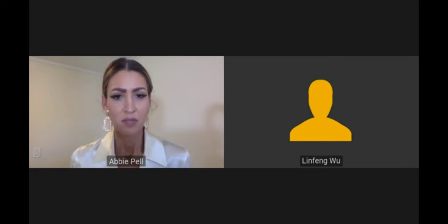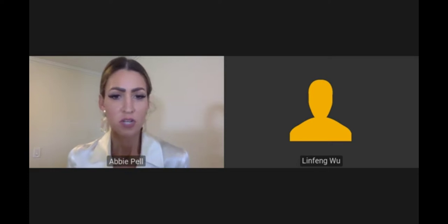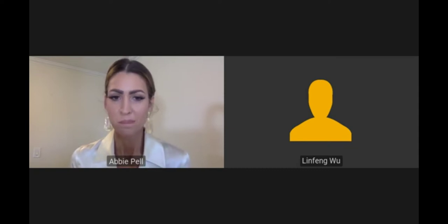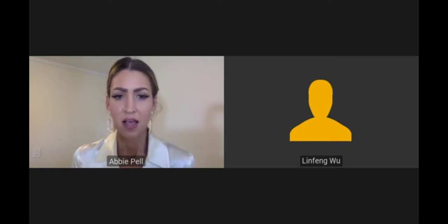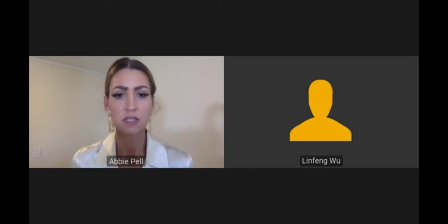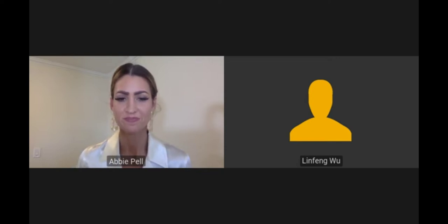I want to first ask you, Linfeng, the first question is, are the LC software and MS acquisition software integrated together? And the second portion of that question is, since the LC and MS instruments are from two companies, how many computers do you need to control the LCMS platform?